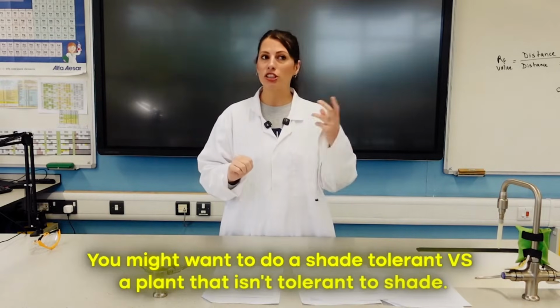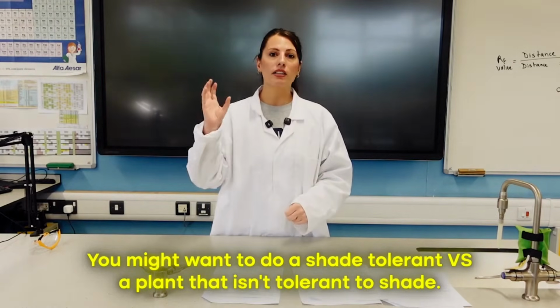I'm going to be comparing two different leaves. Whatever you have available, you can choose to compare. You might want to do a shade tolerant versus a plant that isn't tolerant to shade to see if there's any difference in the type or proportion of those pigments.